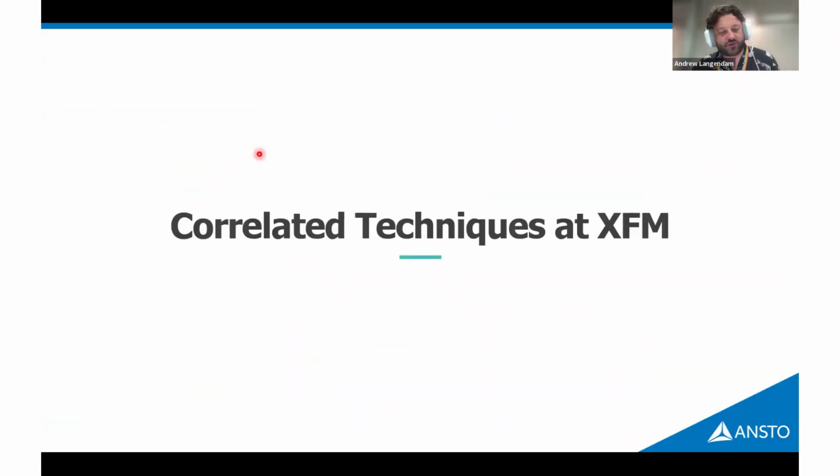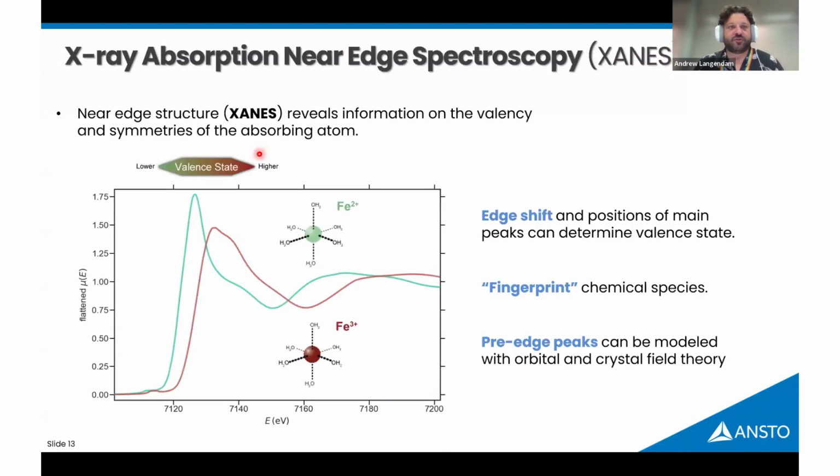So that's all well and good, but I'm here to talk about multimodal techniques and what the hell that means. So I'm going to talk about some correlated techniques that we can do at XFM. And the first one I'm going to talk about is spectroscopy. So just a bit of an introduction to spectroscopy.